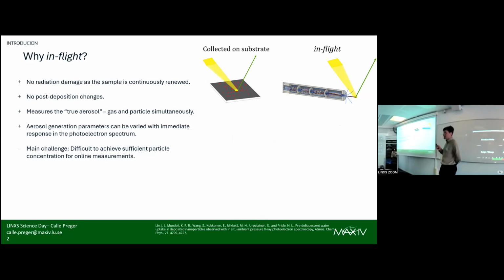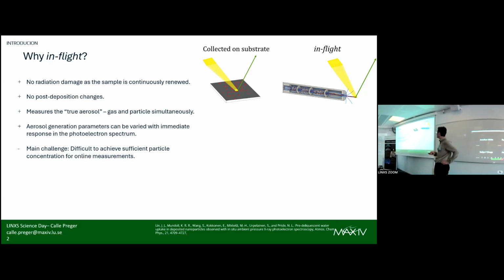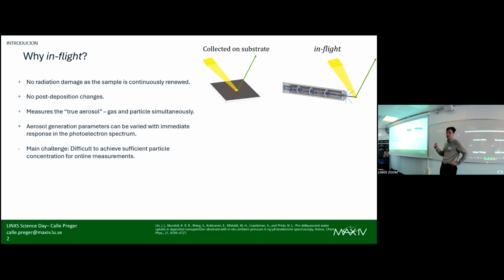So we're doing this in flight. Instead of collecting the particles onto a substrate, we have the particles already airborne in an ambient gas in an aerosol system, and we just let the particles flow through, and the photon beam hits the particles without any substrate.